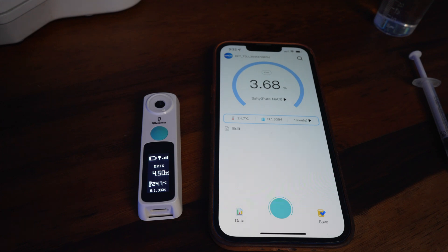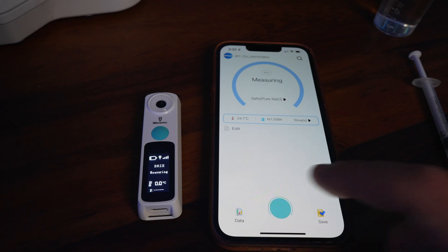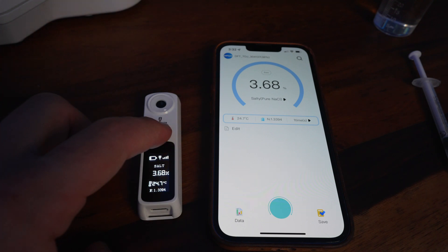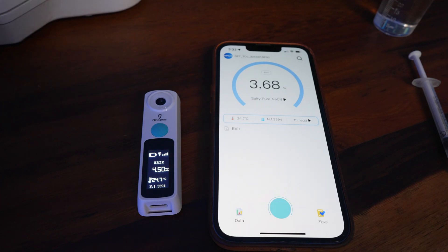I did find a pretty significant issue which I hope the company will fix. When using the button on the device itself to measure salt, it will measure in Brix — which is not what we want. We want salinity. So if it's paired to the iPhone and I press the button, it measures in Brix and then converts to salt. But even after setting it to salt, pressing the button reverts back to Brix. Hopefully the company will address this when they target it more towards reefers.